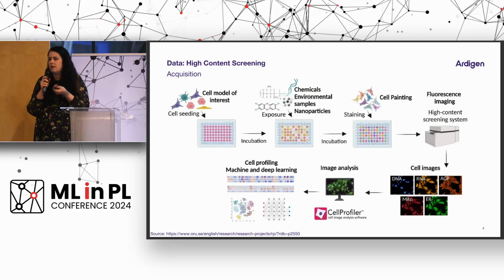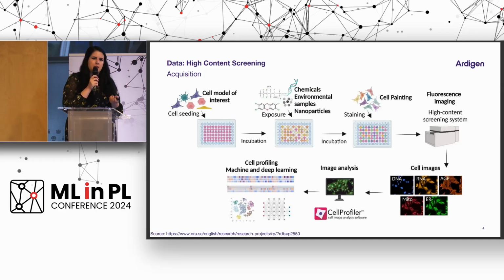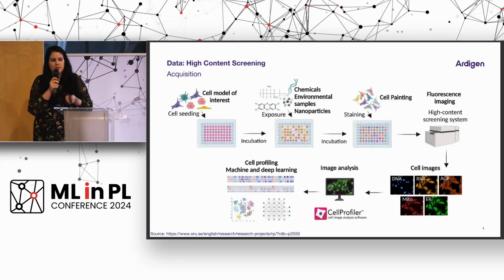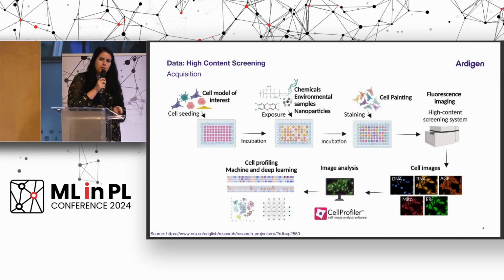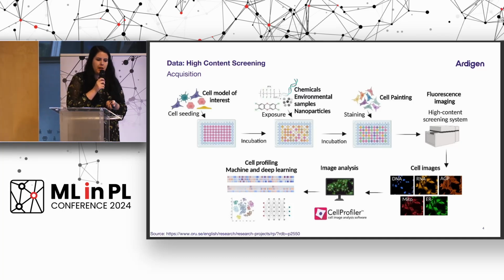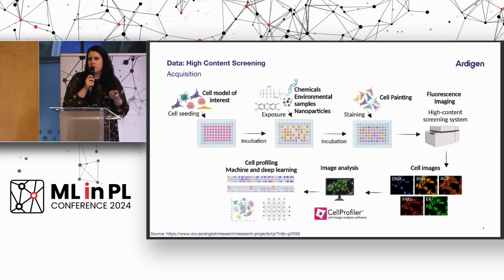Of course, we can take a regular picture with a microscope that's called bright field, but this will result in a grayscale image where we cannot really see a lot of details. With dyeing the cells, we actually can see a little bit more, even the parts of DNA and so on. And those cells are stained with fluorescent dyes that do not do anything special to the cell other than attaching to one part of the cell and showing it.